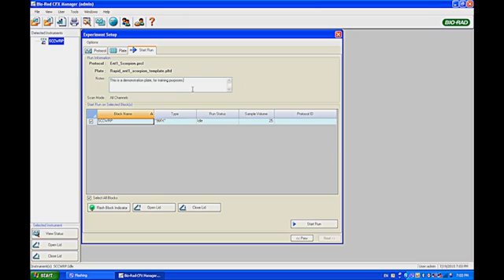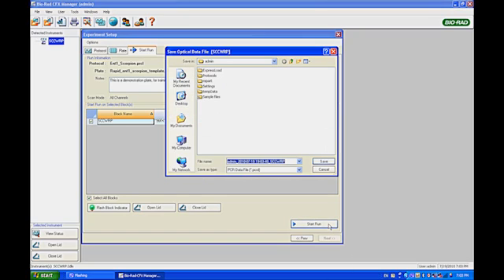You are now ready to start your qPCR run. Click Start and name the assay with your name and today's date.